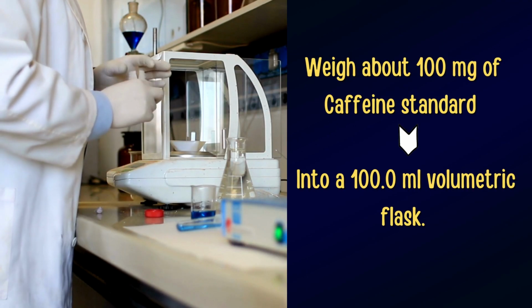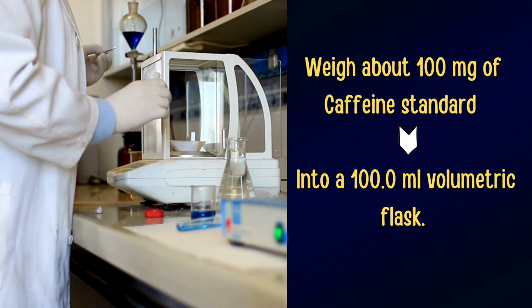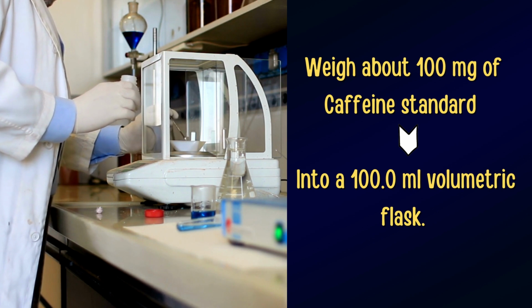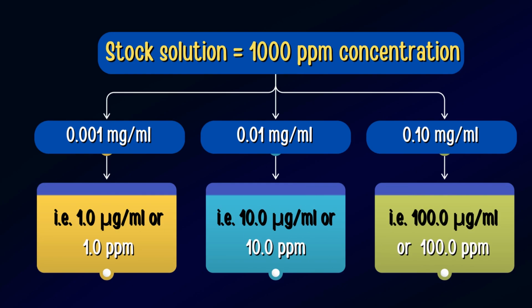After that, we have to prepare detector linearity solutions. For this, accurately weigh about 100 mg of caffeine standard in a 100 ml volumetric flask. Dissolve in 10 ml of methanol, make up to the volume with mobile phase. This will give 1000 ppm stock solution. From this stock solution, further dilute accordingly with mobile phase to get solutions having concentrations of about 0.001 mg per ml, 0.01 mg per ml and 0.1 mg per ml, that is 1.0 microgram per ml, 10 microgram per ml and 100 microgram per ml respectively, or else we can say 1 ppm, 10 ppm and 100 ppm respectively.